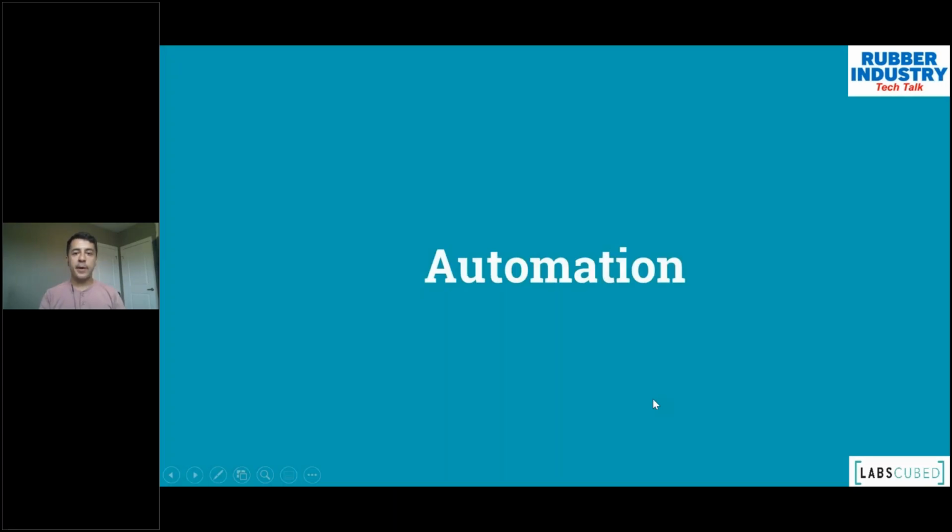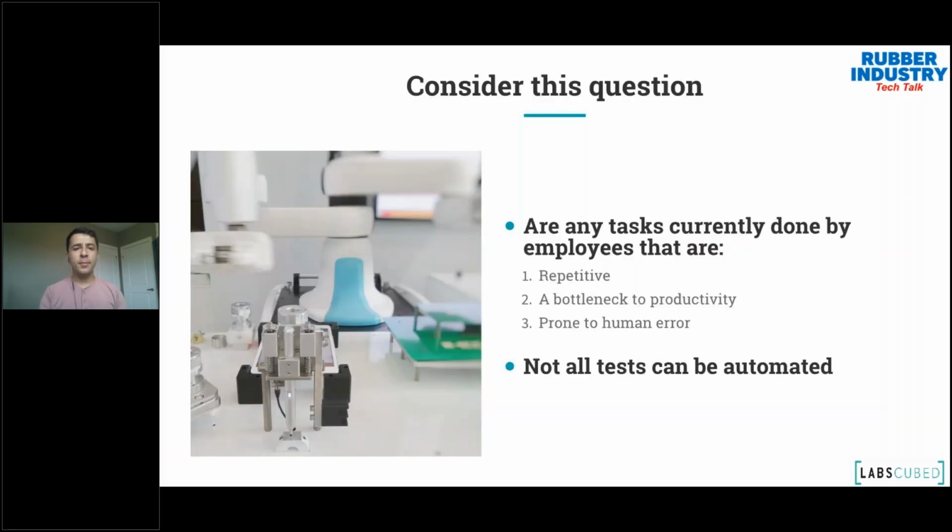So quickly about automation. I'm not going to talk about robotics and systems. I think we've all seen them. You'll see them in manufacturing. You see them everywhere. But the main thing I always ask people when they come to us to talk about automation in their labs is, do you have tasks that your employees are currently doing that are repetitive, that are a bottleneck, slowing things down, that have human error associated with them, that you have to retrain people? When you have to hire a new technician, it takes a really long time to train them to get really good data. If your answer is yes, then that's something you should be looking at automating in some way or another.